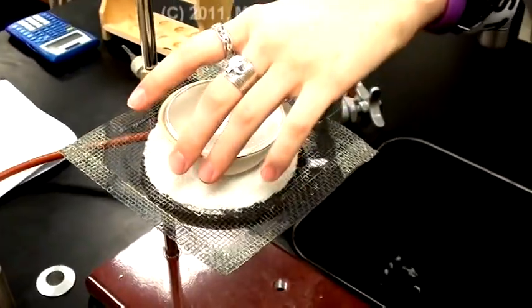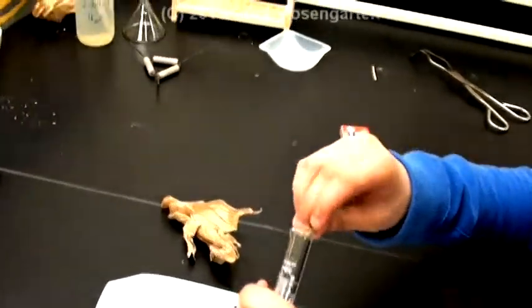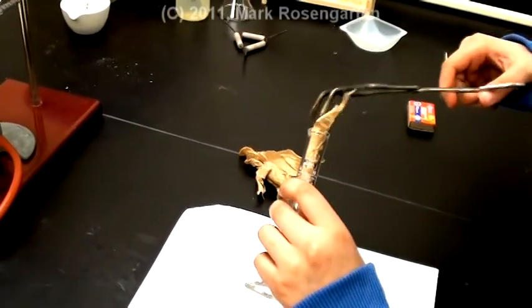This way you can avoid flash frying your hands. As you're finished with each step, you can clean up each piece of glassware and place it back at the edge of the lab station out of the way. Cleaning up as you go means you don't have to clean up when you're done.